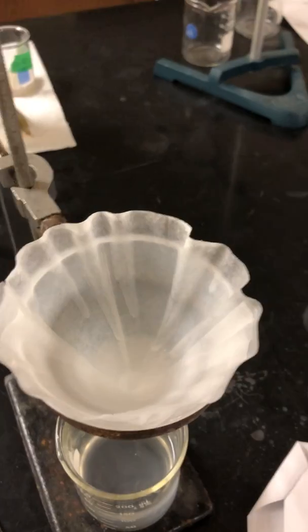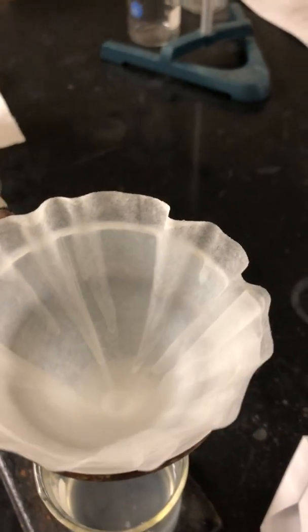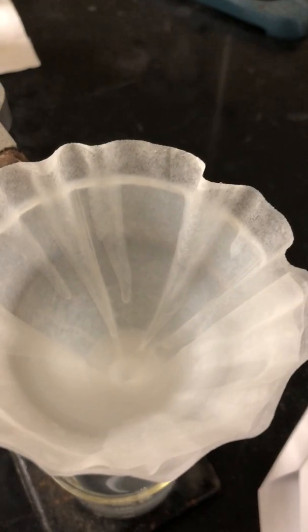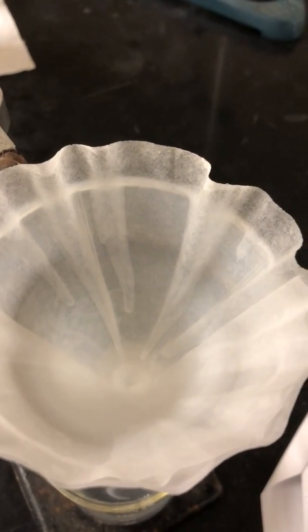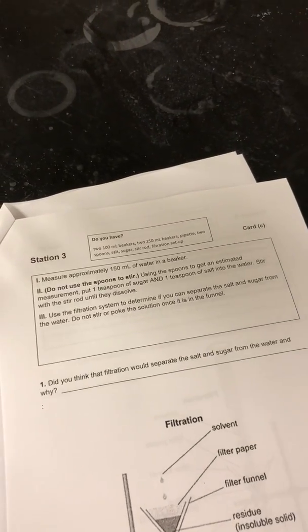This is the part of lab that is usually not fun and where we start talking to our partners, and we really shouldn't. We should be observing. So be patient. Nice. Look at that. I do not see any salt and sugar. The question is, did you think the filtration would separate the salt and sugar from the water, and why? So you will answer that. Let's go to station 4.